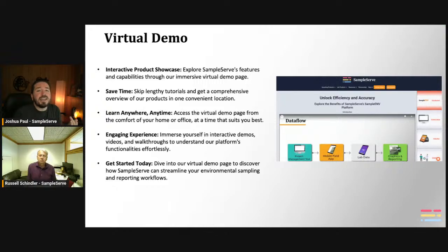It's media agnostic in the sense that we're talking about the process, the workflow, but when it comes down to certain media, there are going to be subtle differences in your workflow depending on what you're sampling and what kind of data you're collecting. But it all boils down to putting something in a container and sending it to a lab. So we don't really care what exactly it is. Exactly.